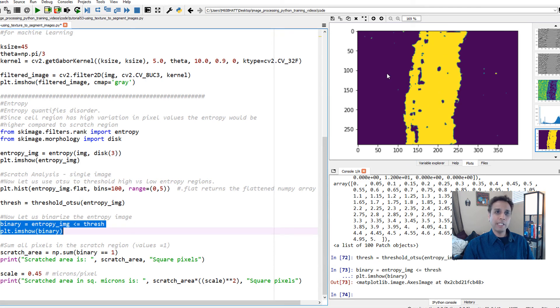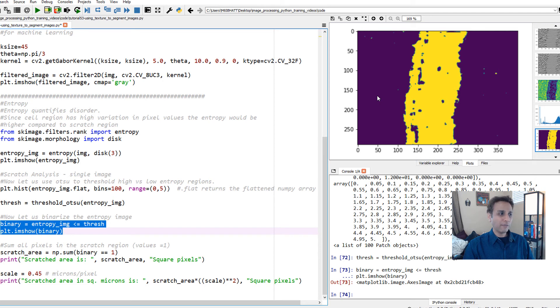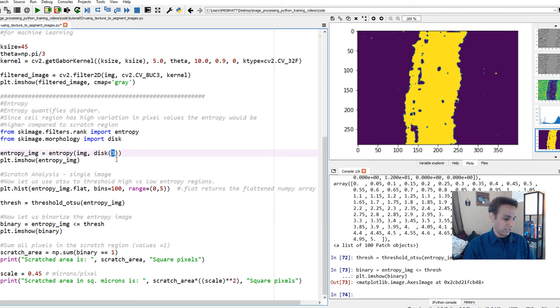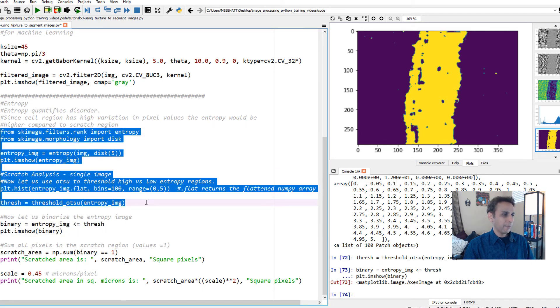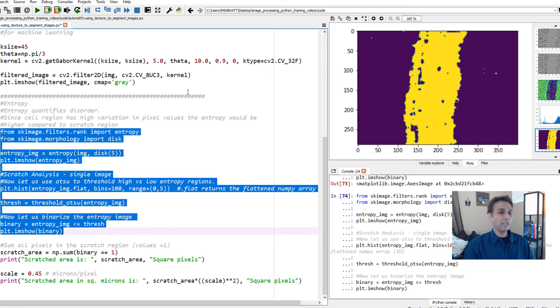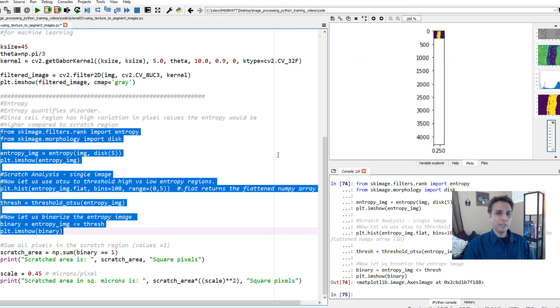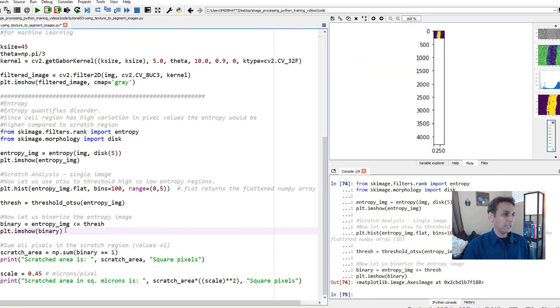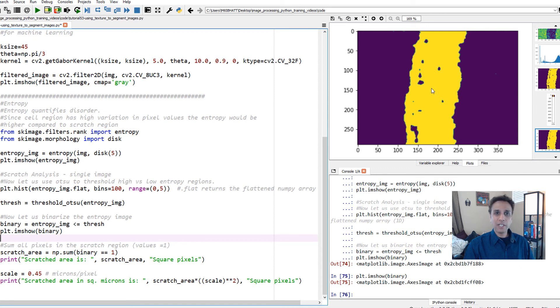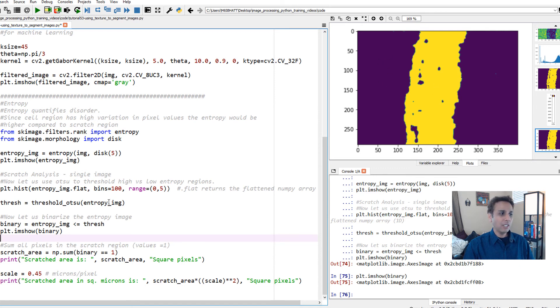Extract that and plot it. If we look at the plot, there you go. Now we separated the high entropy region or cellular region. Go ahead and play with the disk size to see if you can get rid of these features. If we change to disk size of 5, let's see how that looks. It's getting slightly better, but you got the idea.